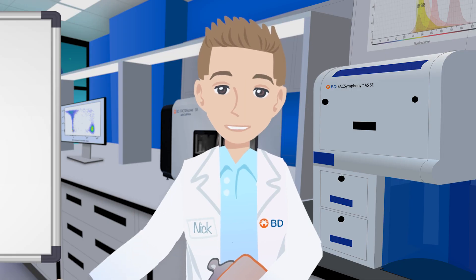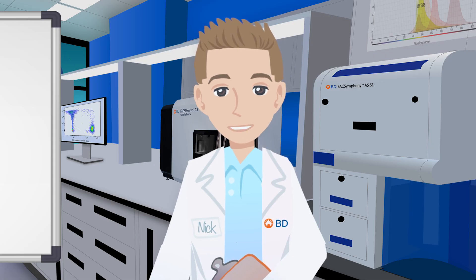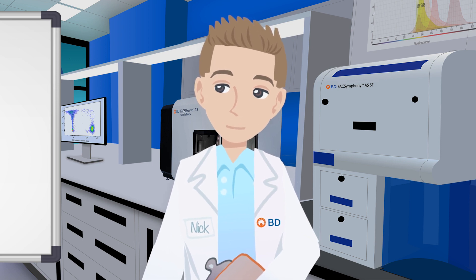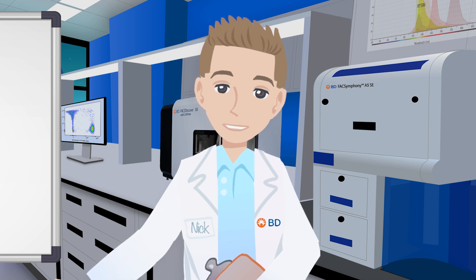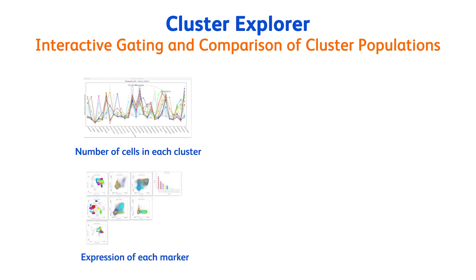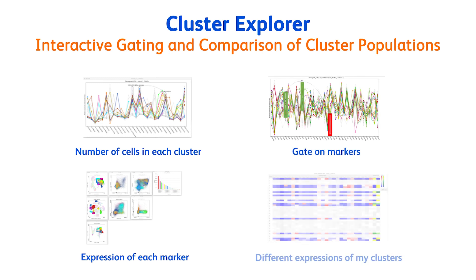Now I have my visualization and the different clusters. But how do I identify the phenotype of those cells efficiently and compare expression between experimental conditions? Thanks to the Cluster Explorer plugin, I am able to complete the phenotyping and comparison steps. Cluster Explorer, via a series of interactive panels, lets me look at the number of cells in each cluster, the expression of each marker for each cluster, gate on markers, and see the expression of my clusters between experimental conditions.